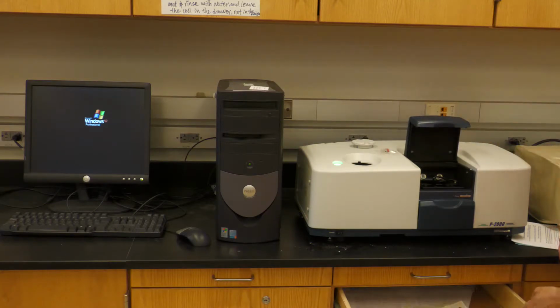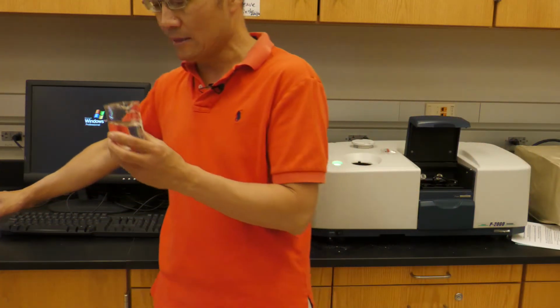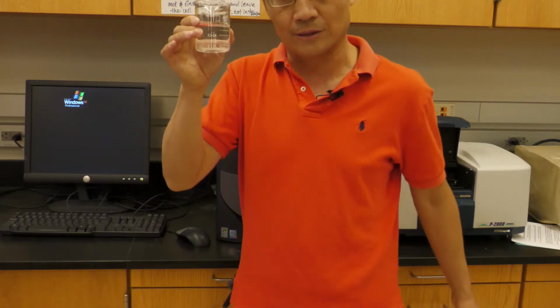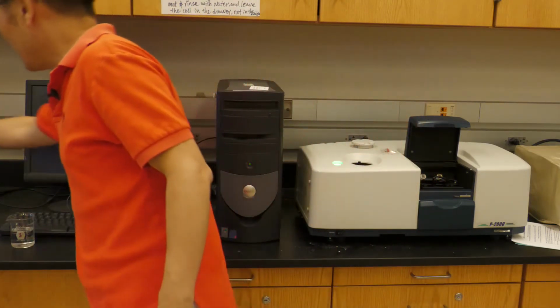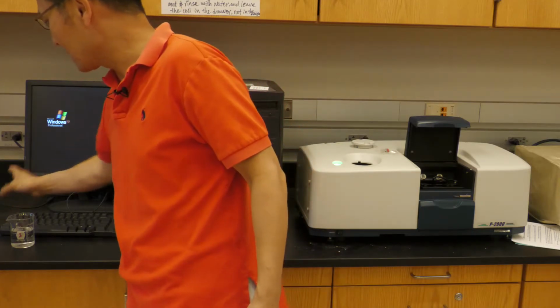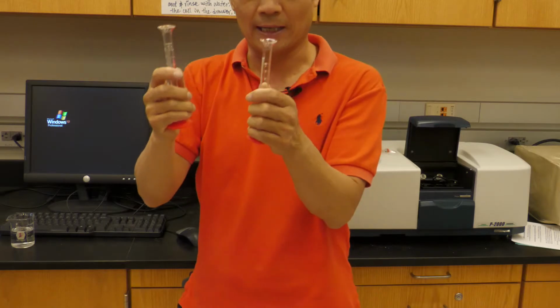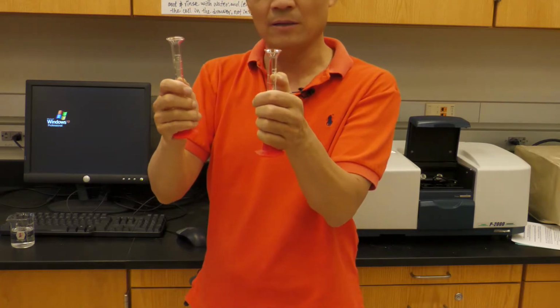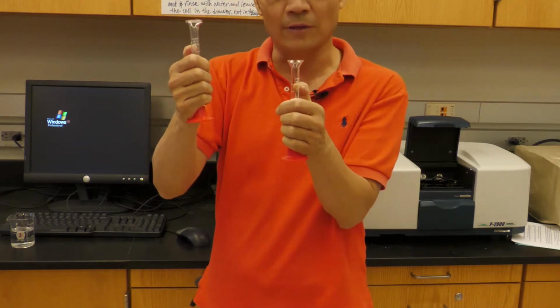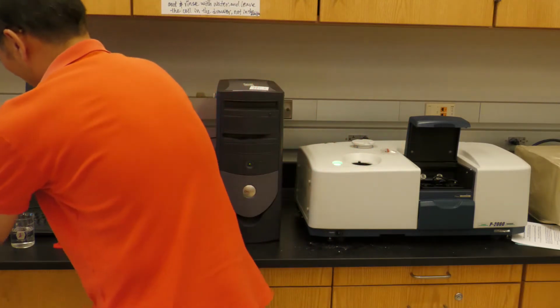Okay, now this is a general idea. Now let me tell you how to do this experiment. Now these are the chemicals you will use. This is the sucrose, and this one is 8 molarity HCl. So we will mix these two. Each of them will be exactly the same amount. So let's say this is 10 ml of sucrose, 10 ml of 8 molarity HCl. So you put this one here.